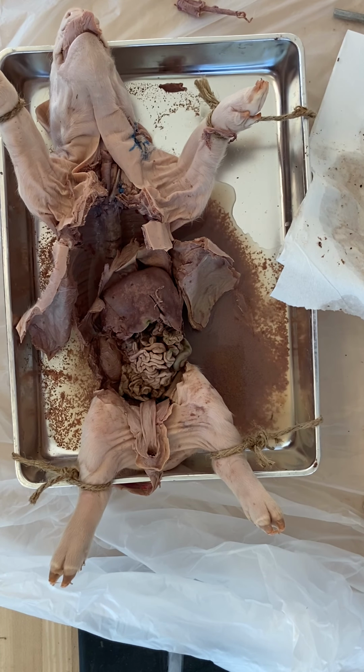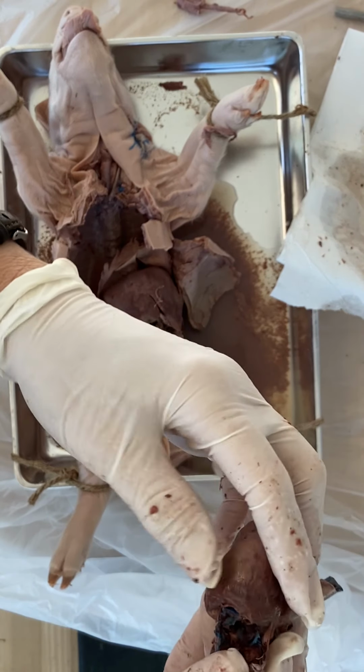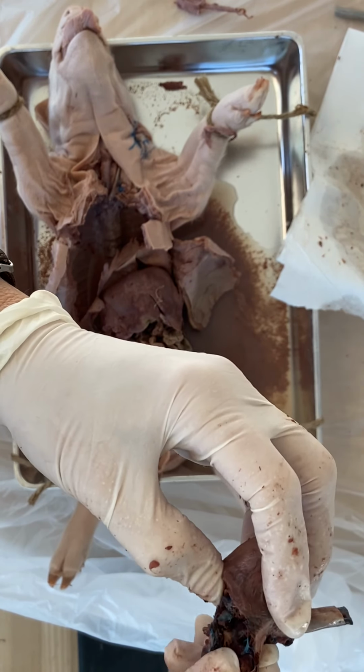It's not cutting easily. It's very stiff. Look at it, you know. Not a good thing when you're doing this. Yeah, trying to get the light in there. I guess that's the valve there. Yeah. There we go, there we go.